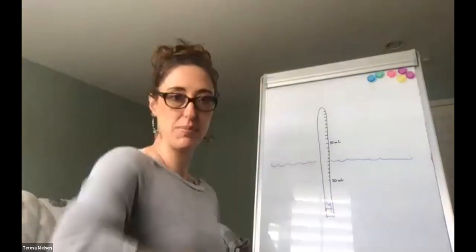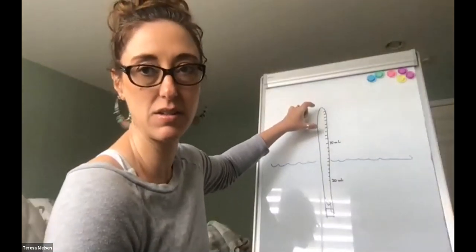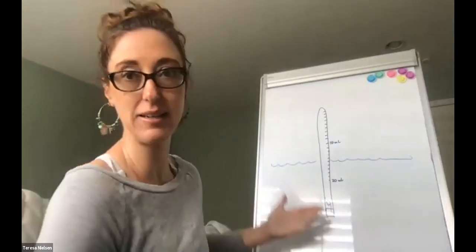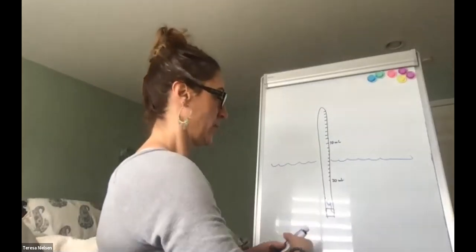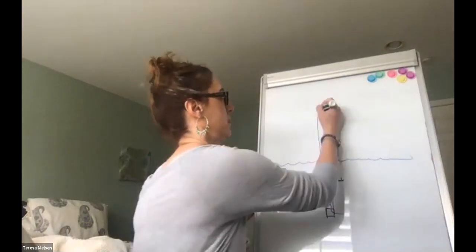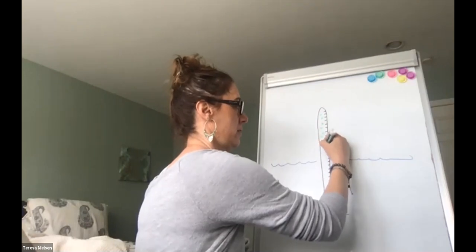And then we turn it upside down underwater, and the hydrochloric acid is up here and it starts to diffuse downward. And when the hydrochloric acid gets to the magnesium, then this reaction takes place and the hydrogen bubbles start to rise. And so we end up with little bubbles of hydrogen up here.